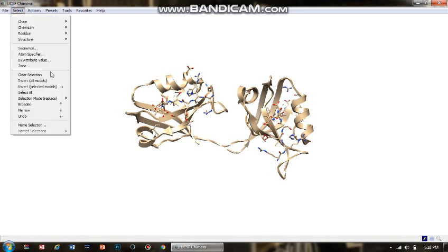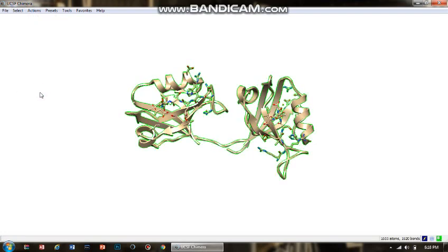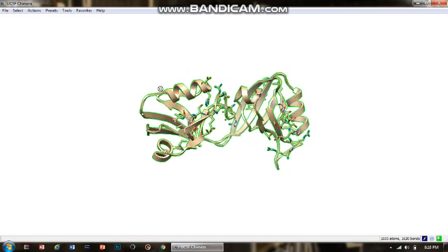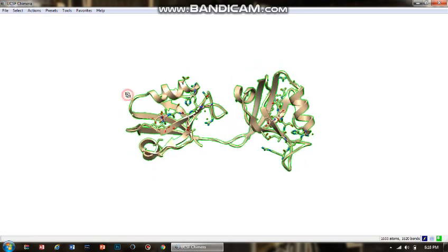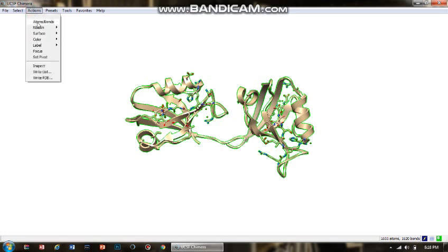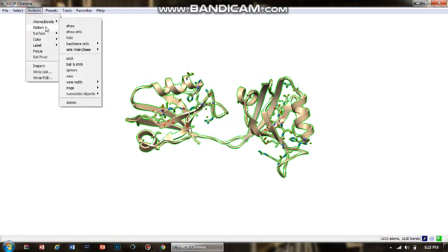First, we have to select the protein molecule. Go to Select, then choose the option that says Select All. A green outline appears, which means the whole protein molecule has been selected.